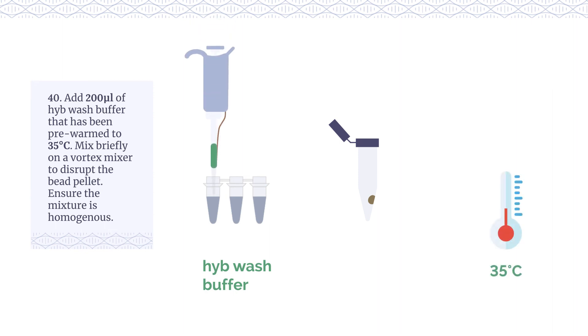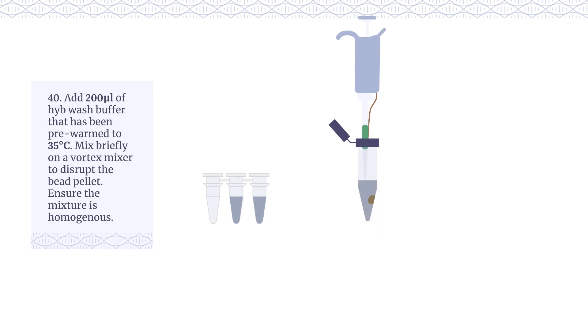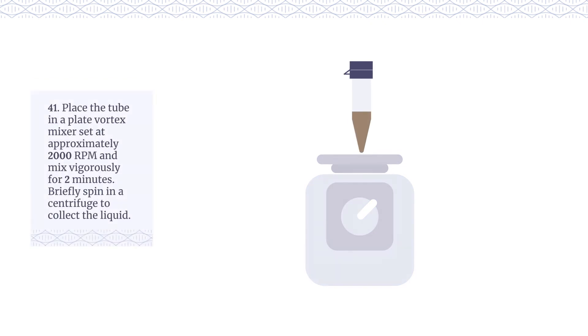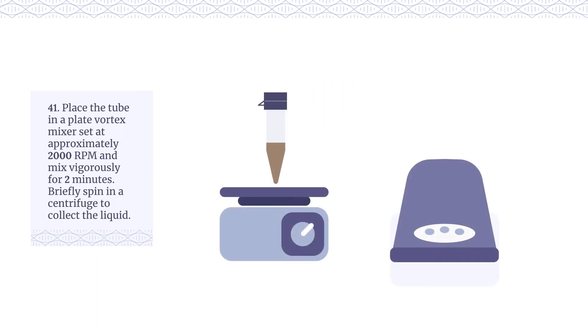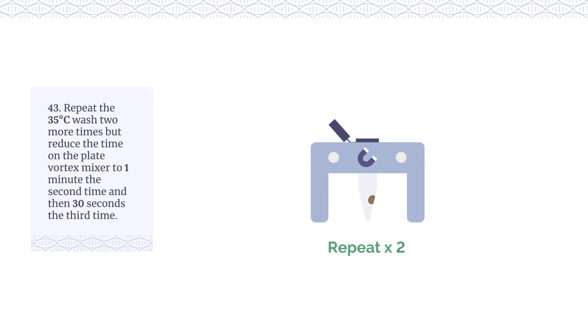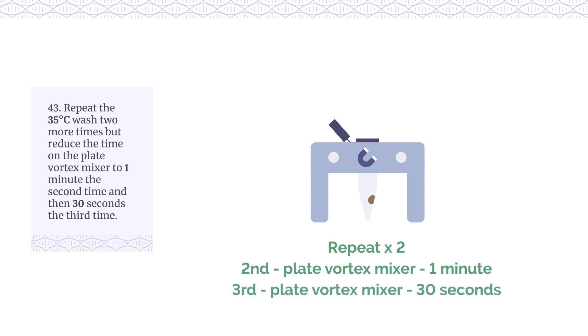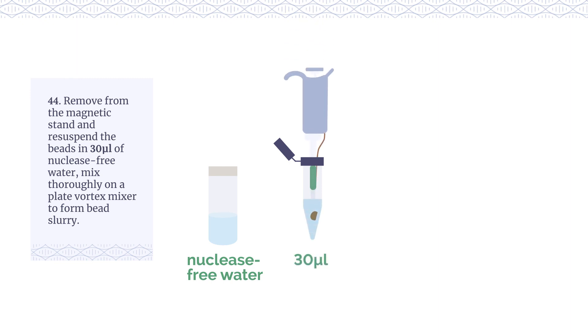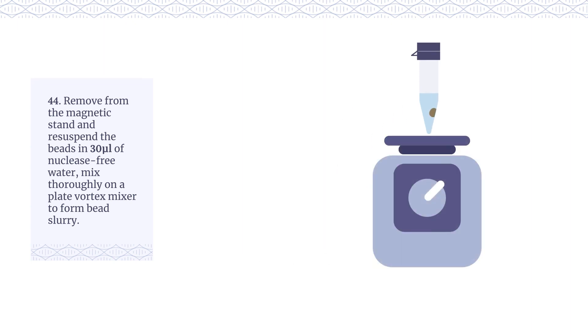Add 200 µl of HYBE wash buffer pre-warmed to 35°C. Mix briefly on a vortex mixer to disrupt the bead pellet and ensure the mixture is homogenous. Place the tube in a plate vortex mixer set at approximately 2000 rpm and mix vigorously for 2 minutes. Briefly spin in a centrifuge, place on a magnetic stand, allow the beads to separate from the supernatant, then carefully remove and discard it. Repeat the 35°C wash two more times, reducing the time on the plate vortex mixer to 1 minute the second time, and then 30 seconds the third time. Remove from the magnetic stand and re-suspend the beads in 30 µl of nuclease-free water. Mix thoroughly on a plate vortex mixer to form a bead slurry.